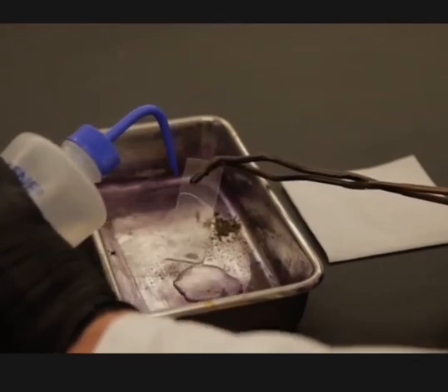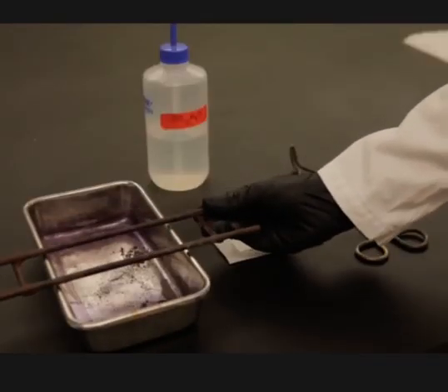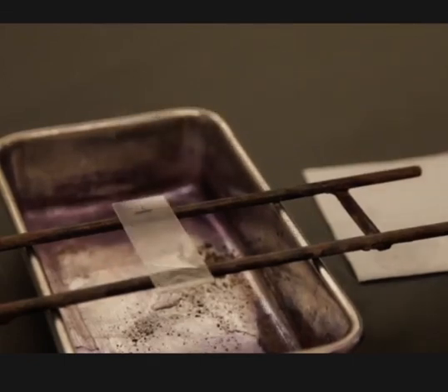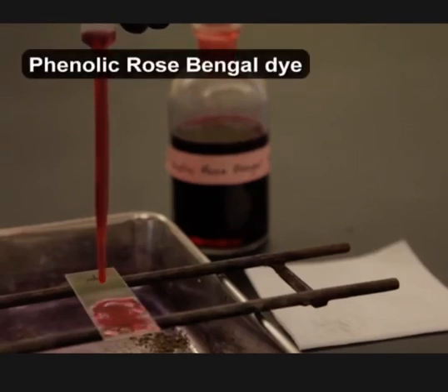Repeat these steps for all slides. Allow the slides to air dry. Support the slide on a staining rack over a container to catch excess dye. Using a dropper, gently cover the surface of each slide with phenolic rose Bengal dye.